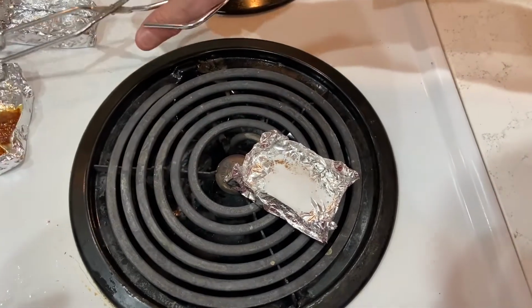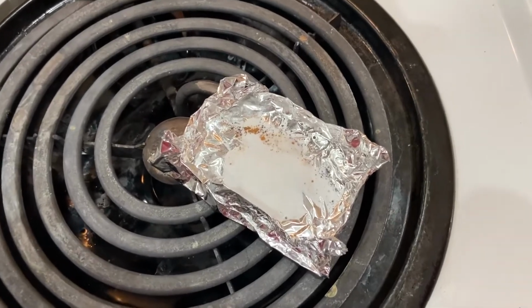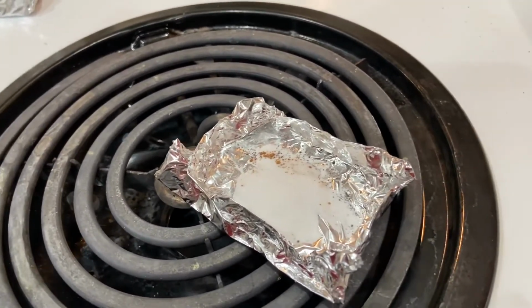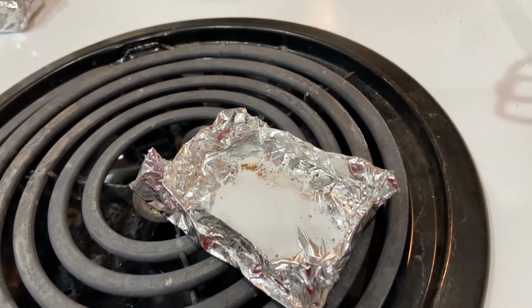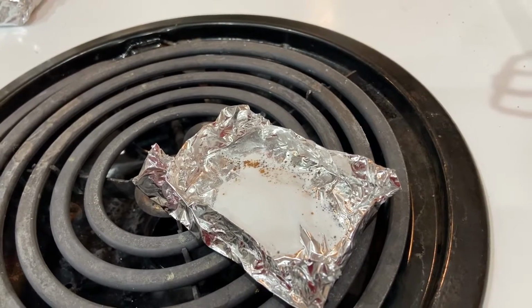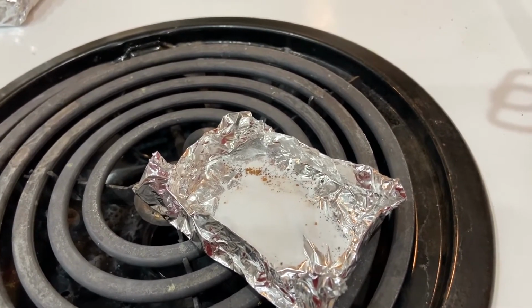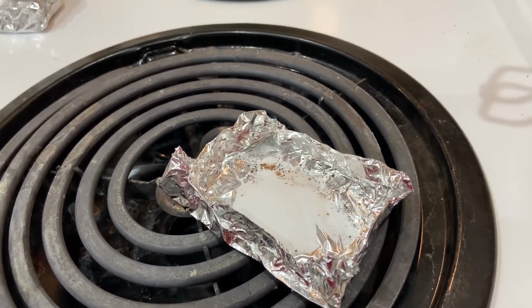And then finally, we can wait a while longer as we observe substance B. It's not doing much of anything. It appears to have a high melting point. Nothing is really melted. It is burning a little bit, turning a little bit brown in a few spots. But other than that, throughout these whole couple of minutes, substance B has not changed.